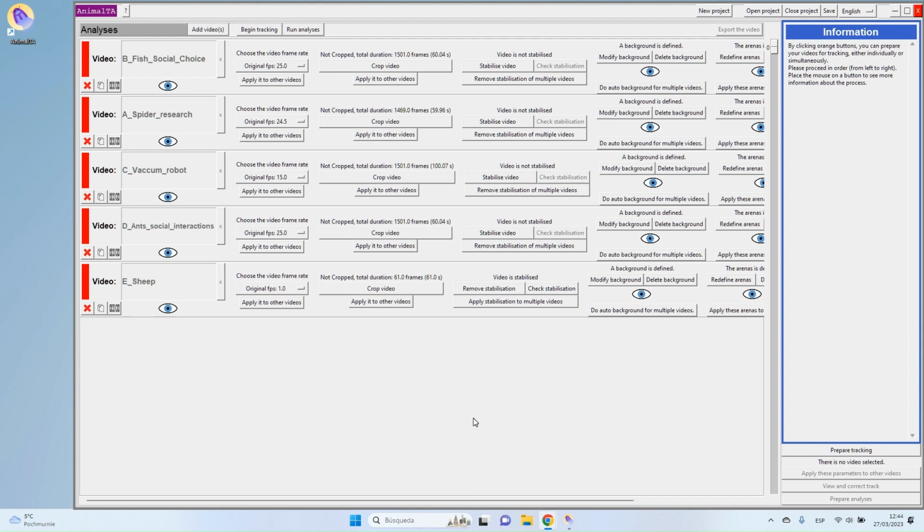In this tutorial I will consider that you already know how to prepare your videos, prepare the tracking, run the tracking and do the corrections of the trajectories. If you have some problems with one of these steps, I invite you to go check the other videos from this channel. Today we will work with 5 different videos.